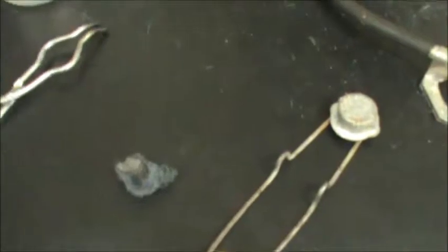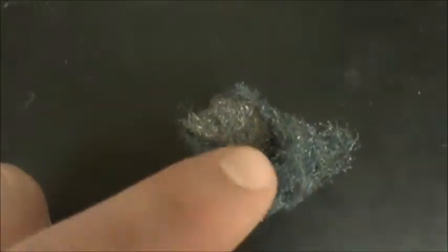Now I'm going to let this sit there and cool off on the tabletop. You can totally see a color difference here. See how the original steel wool that really actually didn't burn is right there. As you can see, I don't want to stick my finger. You can see it right there by the tip of my finger. This is all reacted, so I could tell that because something changed. But you can also see that there is a color change.